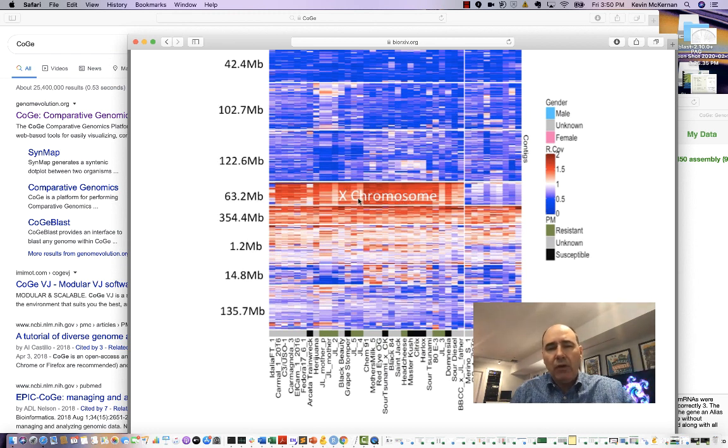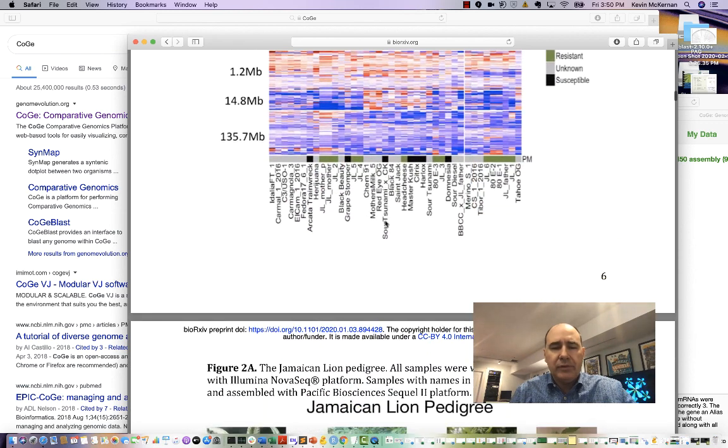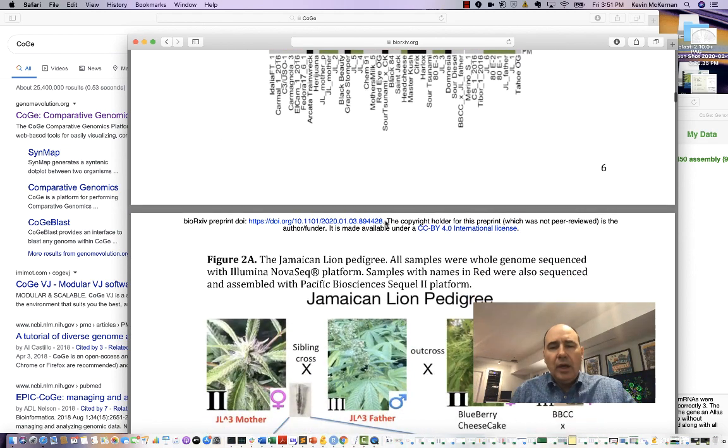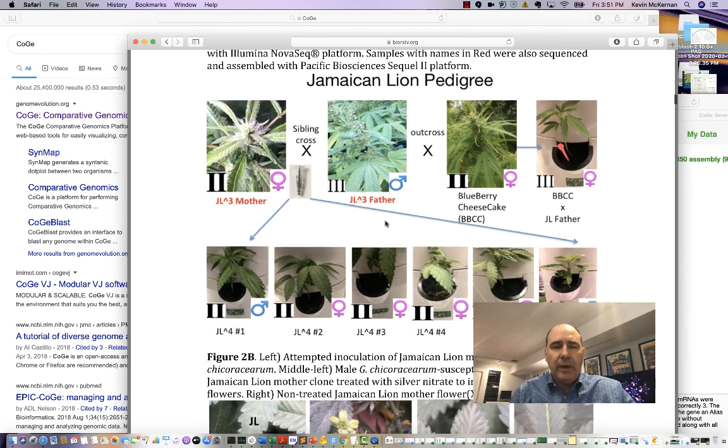It's usually over 100 megabases, and when we add up everything that's going on in the Y, it's the largest chromosome as well, so just a little bit larger than X. That copy number map just helps you to identify which ones are definitively male and female.